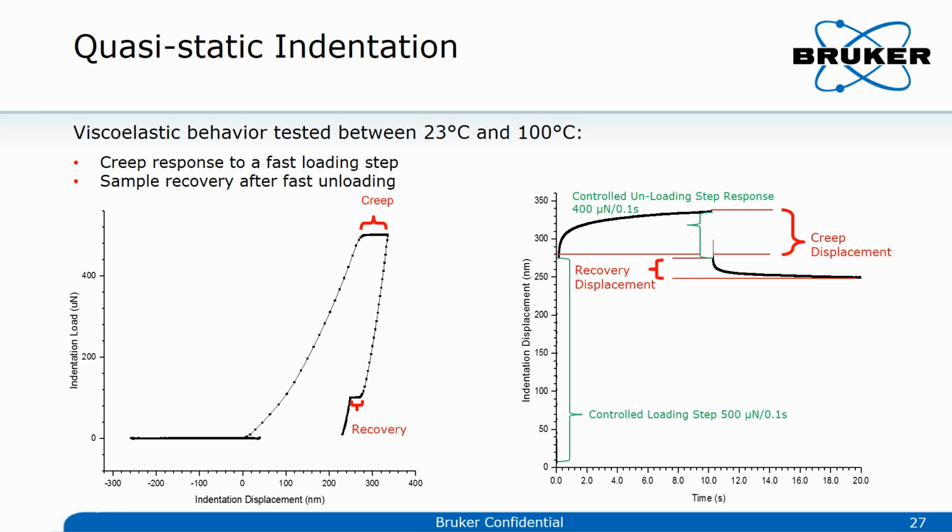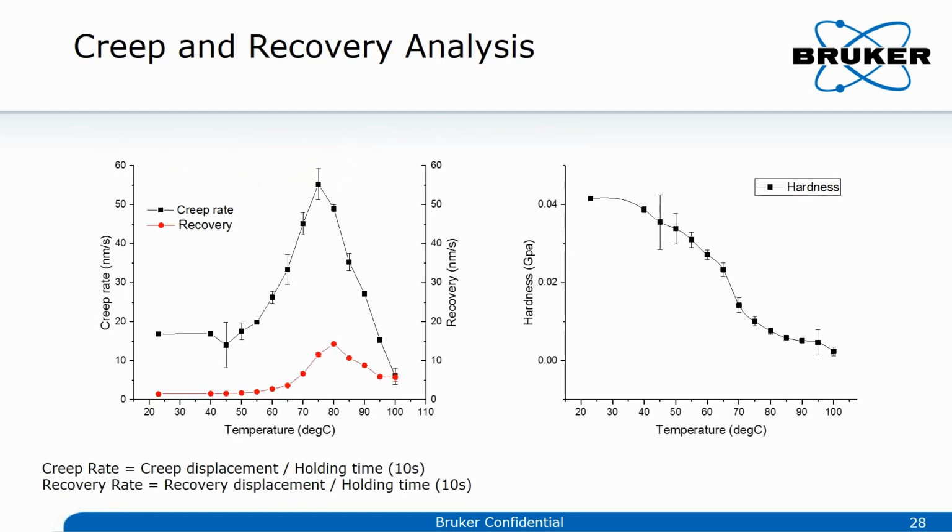The recovery is measured in a similar way. The data points represent 3 measurements of creep and recovery each. The hardness value is determined from the fast unloading after the holding segment at maximum force.